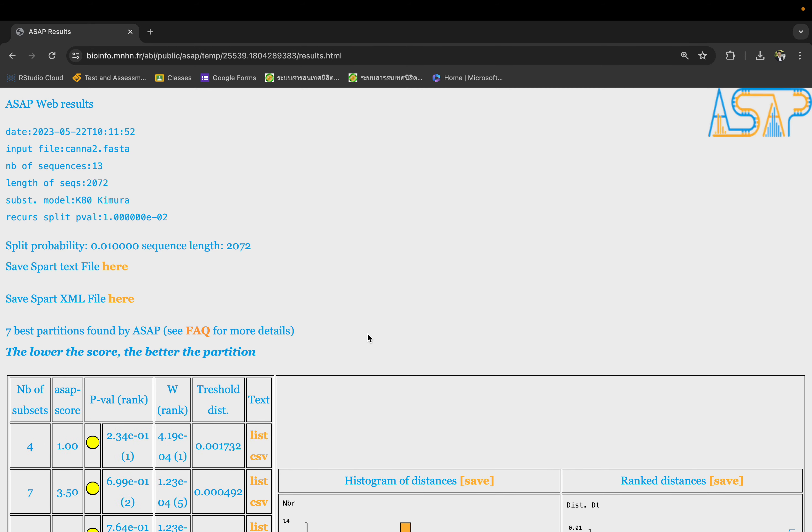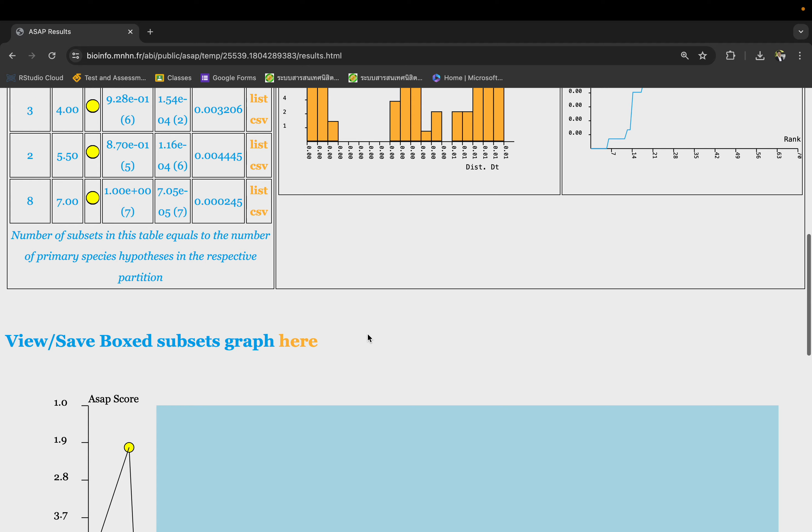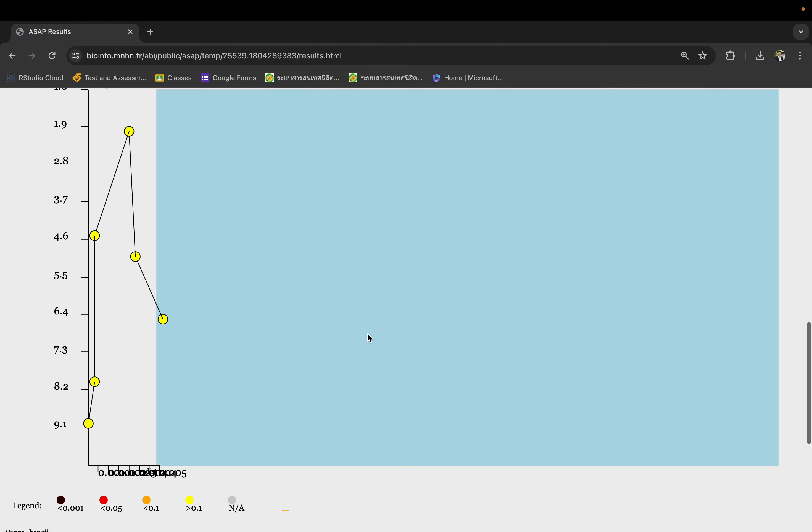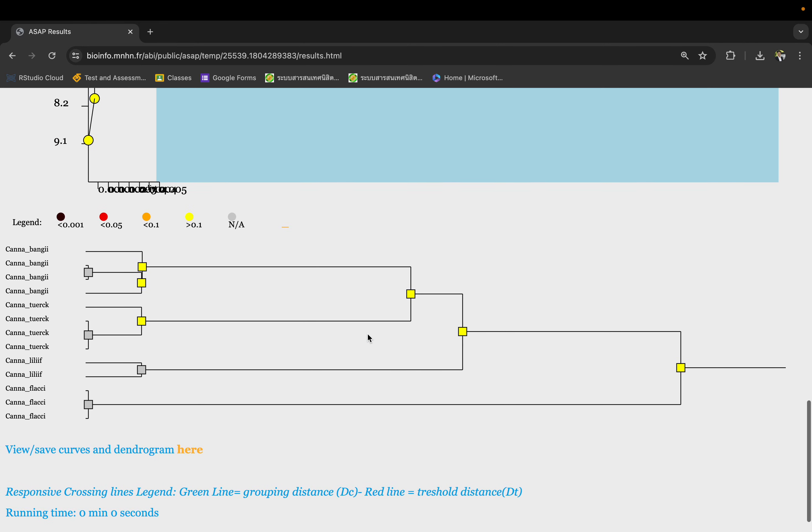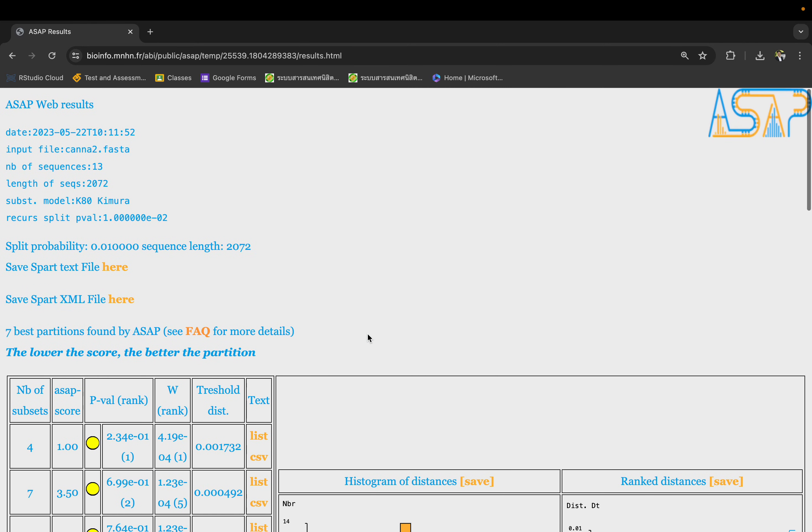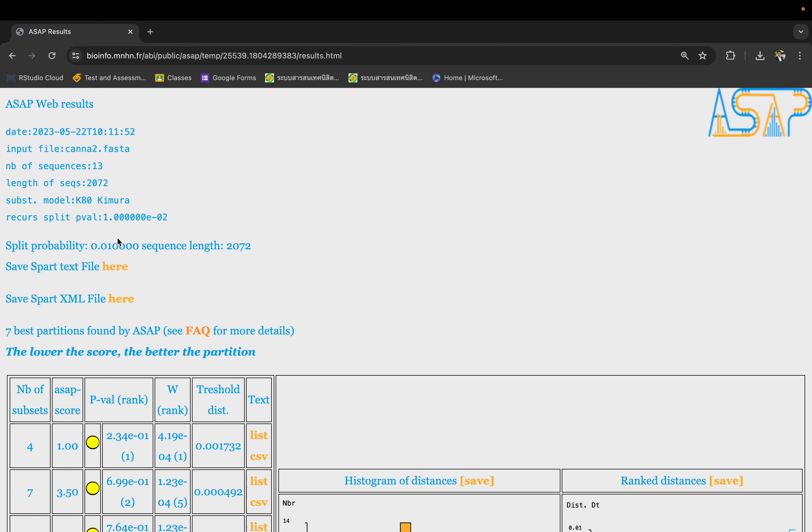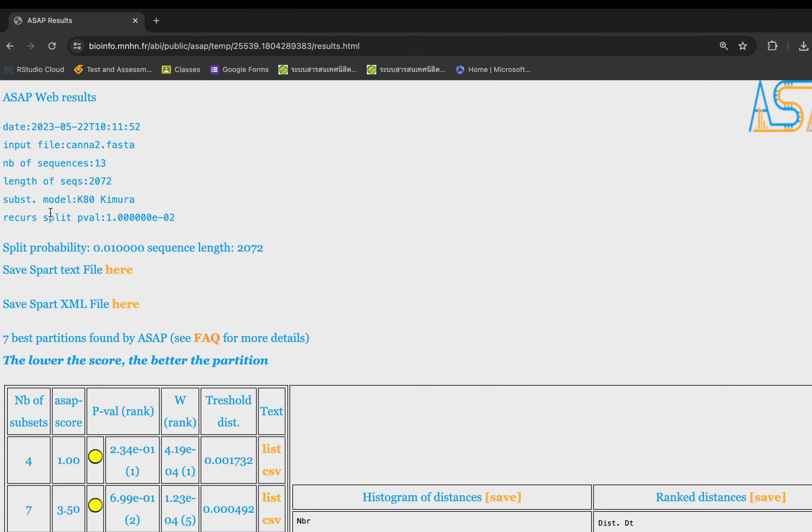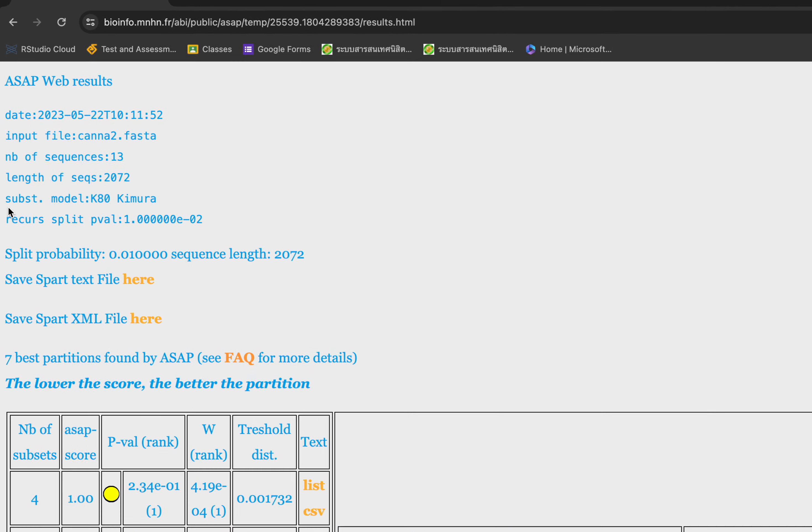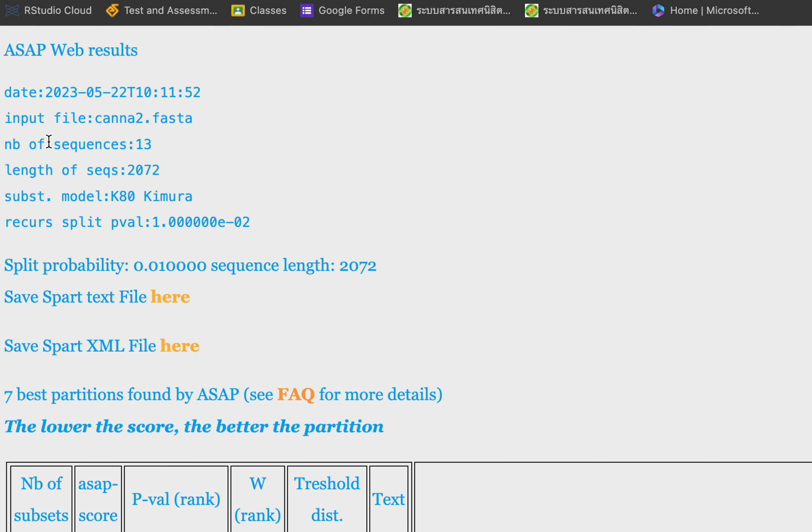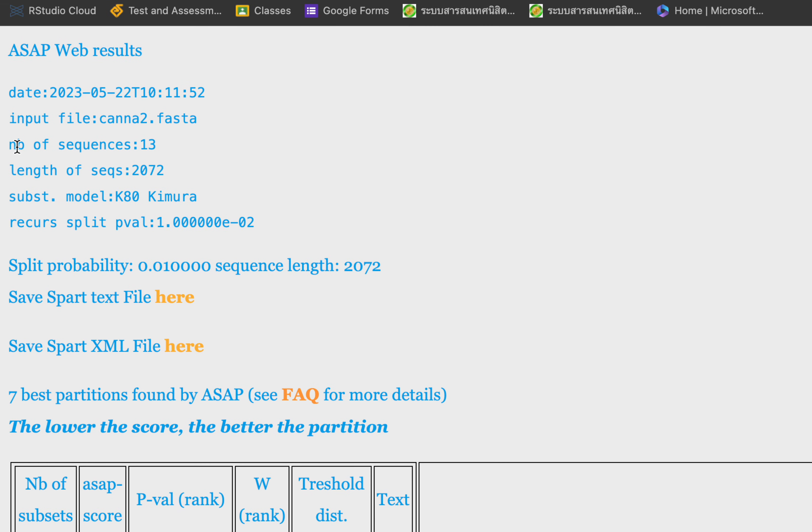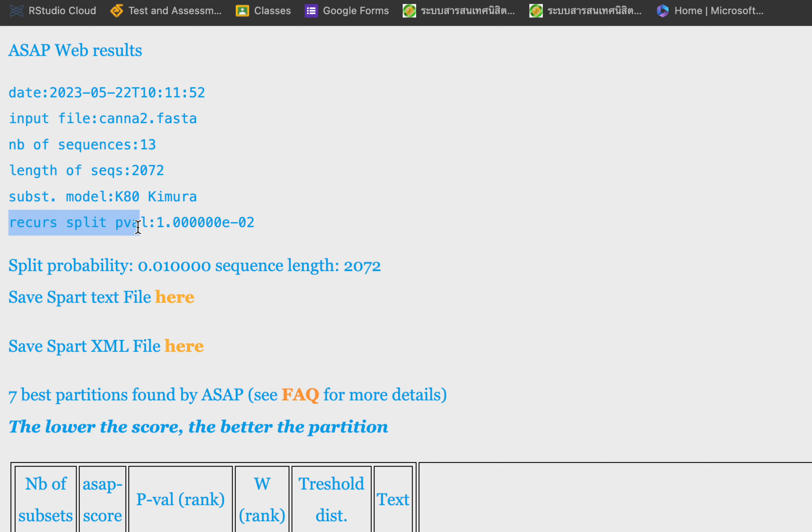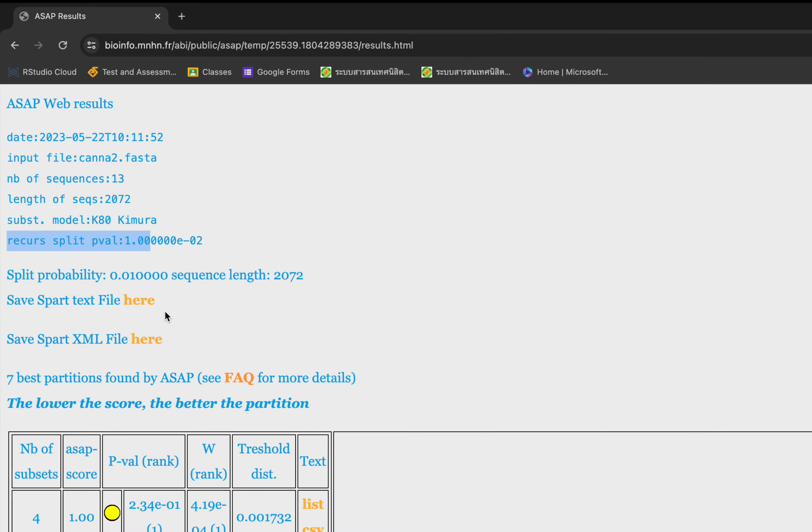So the output - it's going to look a bit complicated, but I'm going to walk you through it. Up here on the left, it shows your file and the number of sequences you put in - 13 sequences and the length of 2000. This is your model and the split probability. You don't have to worry too much about it. If you want to see the under-the-hood files, you can click here. This is the main result. If you have any questions, you can always click the FAQ here, which will provide you more detail on how to read the results.